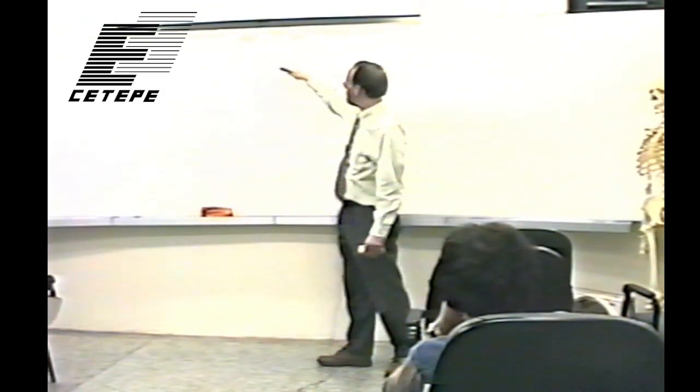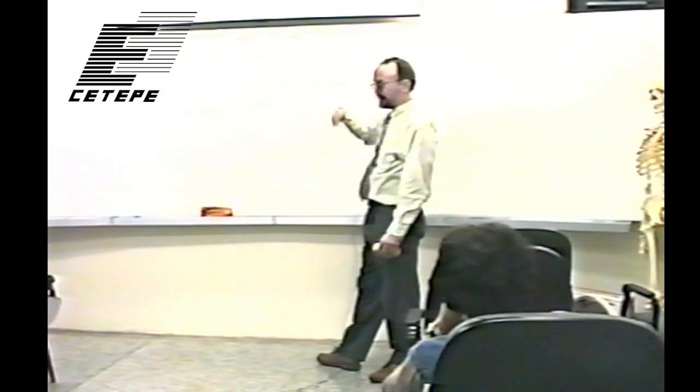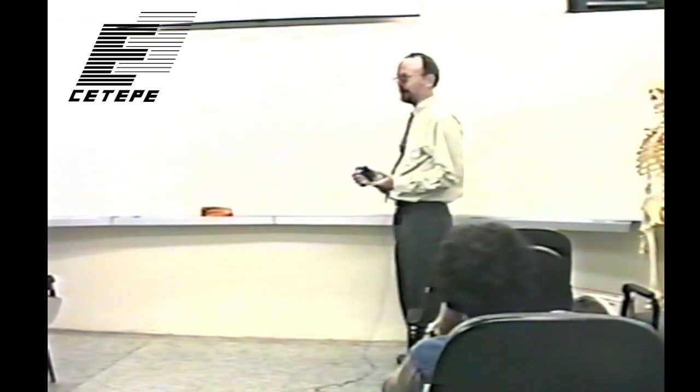It's a very challenging job to take this huge expanse of electrons and focus them perfectly on the output. So there's a geometric distortion that's referred to as pincushion distortion. And I don't know why it's called pincushion. Do you all know what a pincushion is?